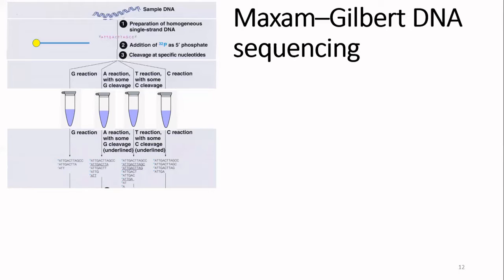In all these mixtures, there is a possibility to have no cleavage at all. So you can see in all these mixtures, the base sequence in the first line is almost the same as the one in the DNA strand. So that means there is no cleavage at all. We have a total of 12 nucleotides. Let's look at the first after that.